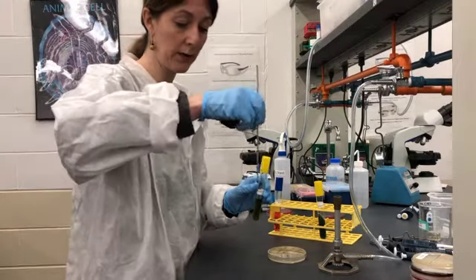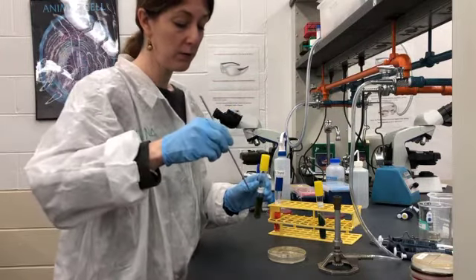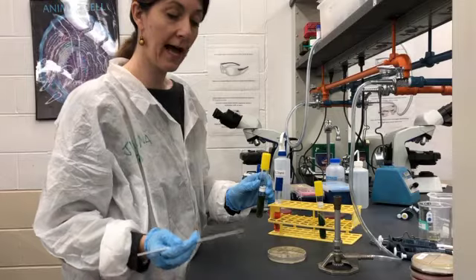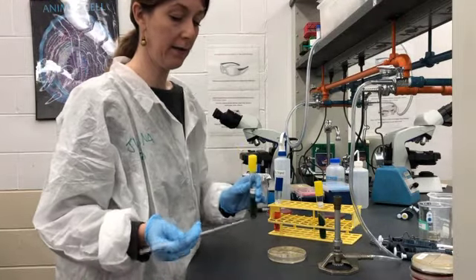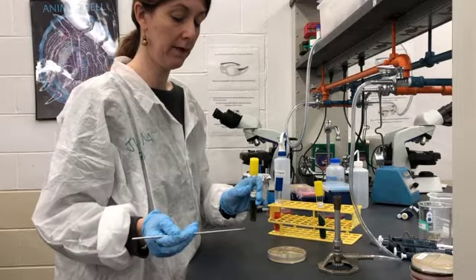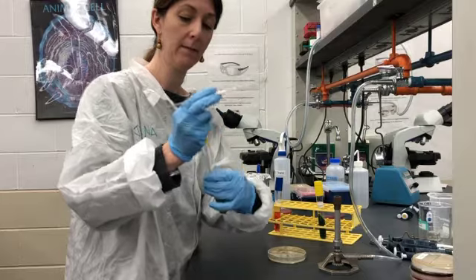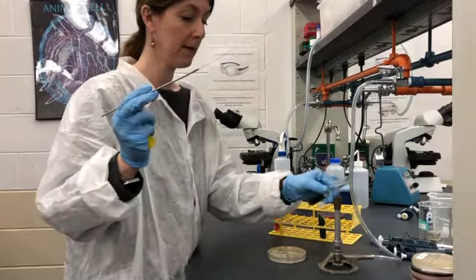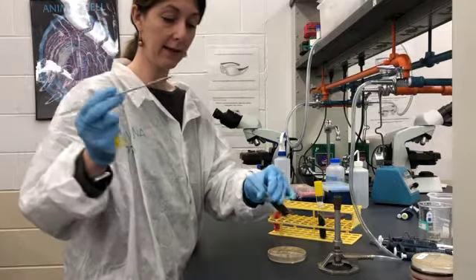I find that I don't want to go straight perpendicular to the plate. Instead, I come to the side, and that allows me to get more of the colony on the broader surface of the needle. So now I'm going to use my pinky. I'm going to pull up the cap. I'm going to heat sterilize the lid.